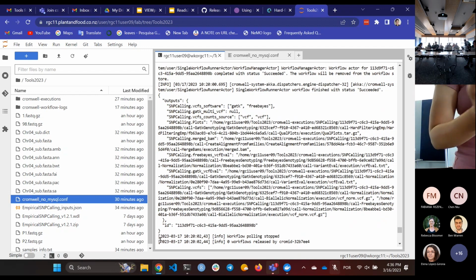But I would not say to run again, because in the next part we will not use the outputs from this part. We could, but what happens is that I made subsets. In the first part, I subset the individuals, so you just have 4 individuals: 2 of them are parents and 2 of them are population. We are working with an F1 outcrossing population, but I didn't want to run like 200 samples because, as you can see, we already fail with only 4. So for this, I subset the samples.